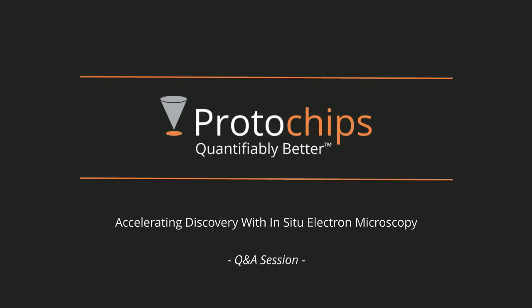Yeah, and some of the electrical studies that I showed, I went through pretty quickly, but especially recently, in some publications using the FIB optimized chips, we've seen atomic resolution under different fields and different current conditions.